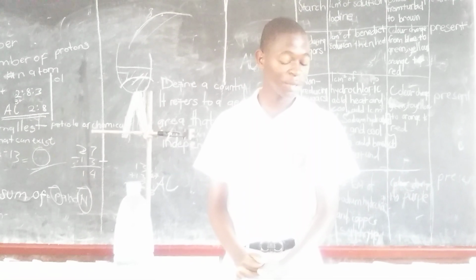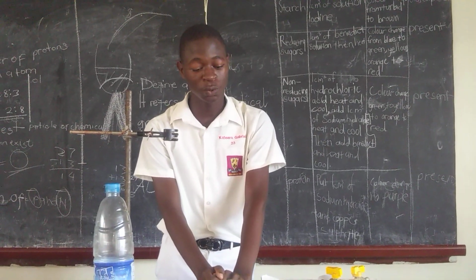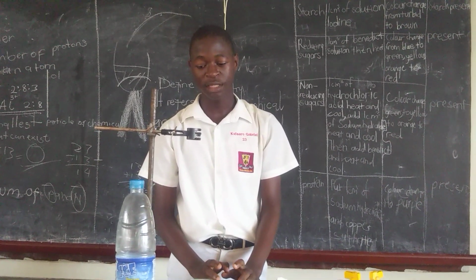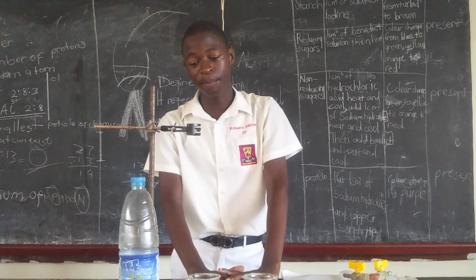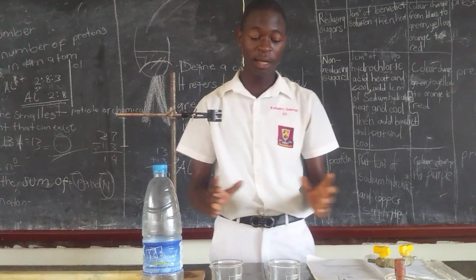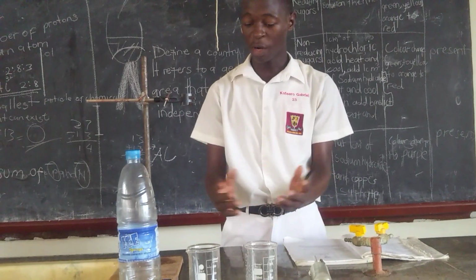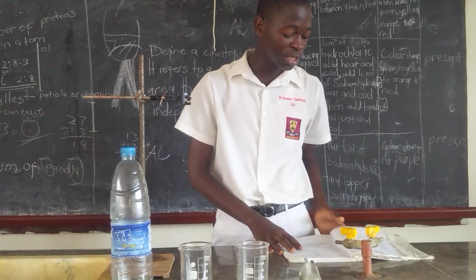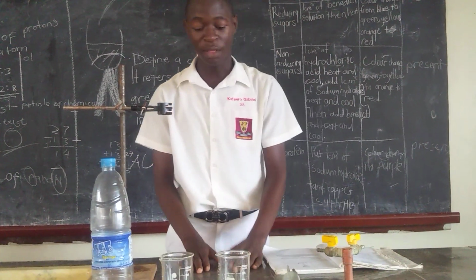As I begin today, as I told you, I'm going to work for you a practical of separating mixtures. That's a Senior One topic. I'm going to do it practically with the help of the equipment here in front of us, with a book here which will guide me for the procedure.